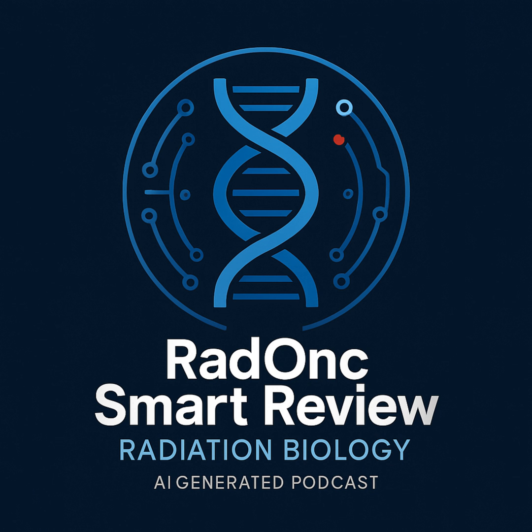It is. But this high throughput dramatically lowered the cost and time for sequencing. It's enabled huge projects: whole genome sequencing, WGS; exome sequencing, just the protein coding bits; RNA-seq to look at all the RNA transcripts, transcriptomes. Right. Targeted panels focusing on specific cancer genes, studying microbial communities, metagenomics, how DNA is packaged, epigenomics. It's just opened up so many doors.